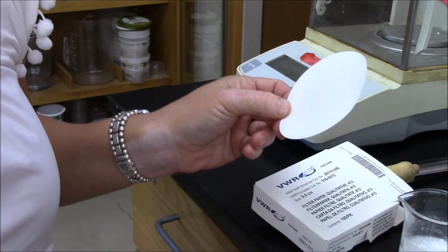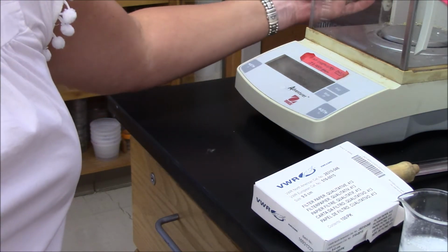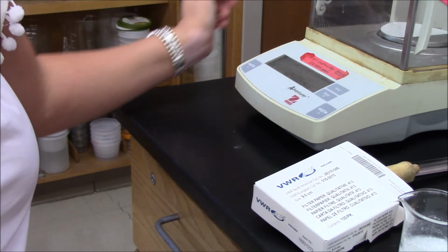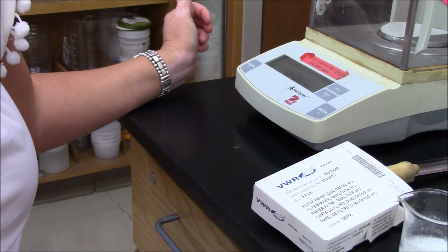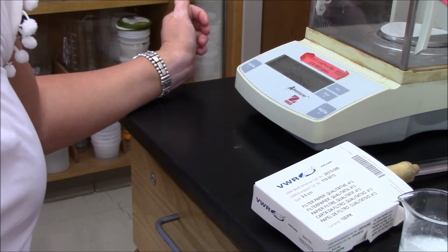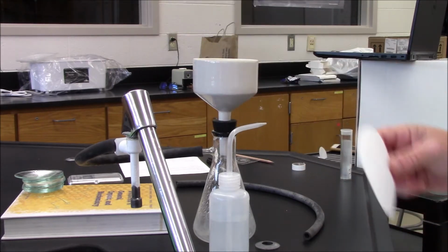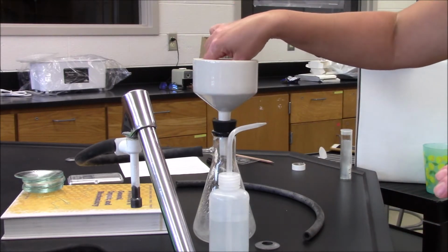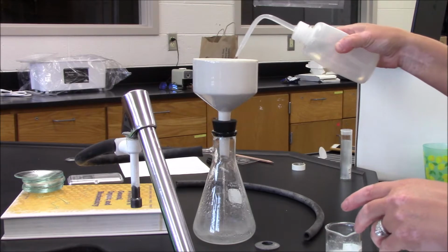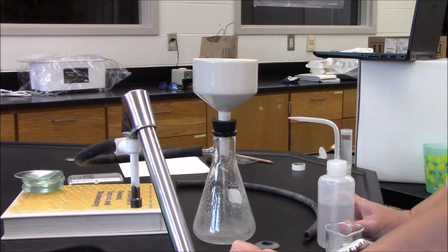In the next step, I need to determine the mass of the filter paper. Using the analytical balance, the mass of the filter paper is determined to be 0.4697 grams. Now it's time to filter. I'm going to take my filter paper and add it to my filter apparatus. I'm going to wet the paper with some deionized water from my wash bottle, and I'm going to turn on the suction.